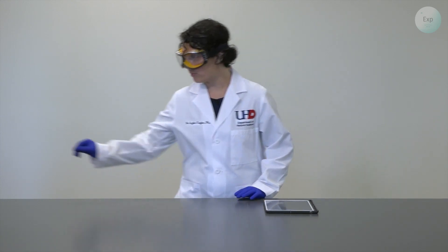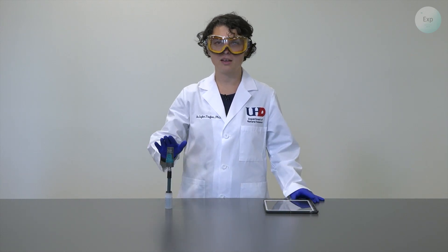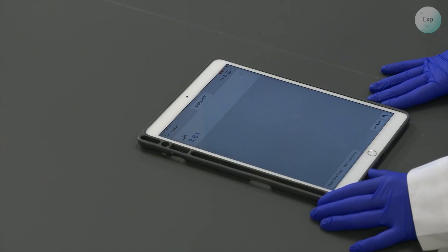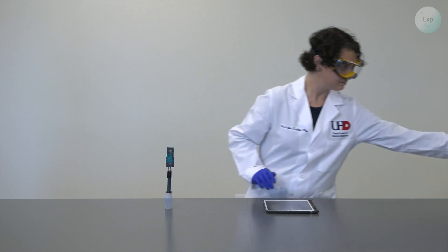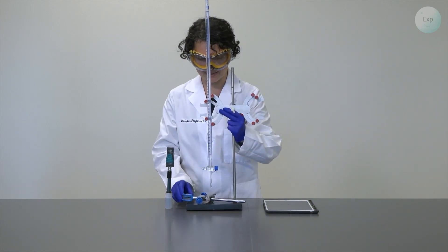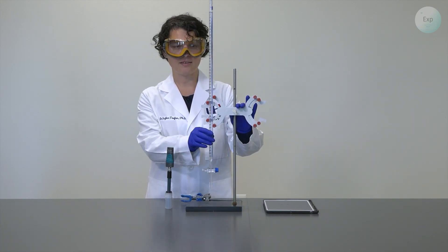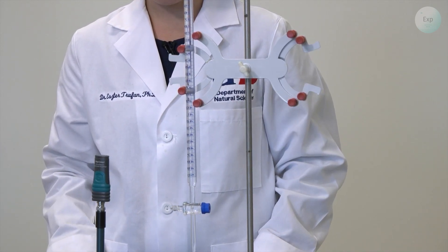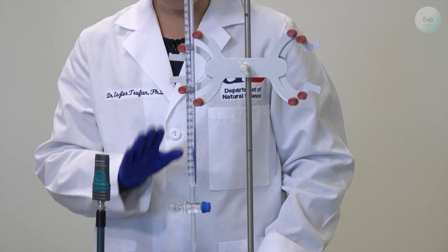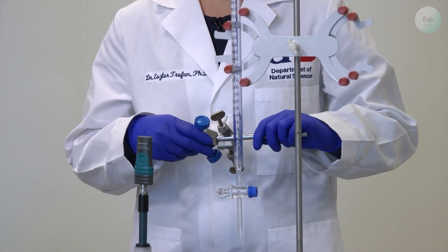After calibrating my pH probe, it will need to be linked through a Bluetooth connection with a suitable device — today I will be using my iPad. For the titration, the first and most important thing is to have a burette filled with a titrant. I have a stand with a burette clamp holding my burette that contains my approximately 0.1 molar sodium hydroxide solution. I will also add another clamp dedicated to holding the pH probe in position.